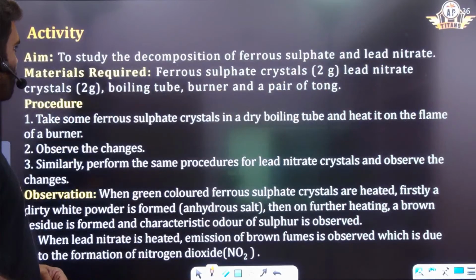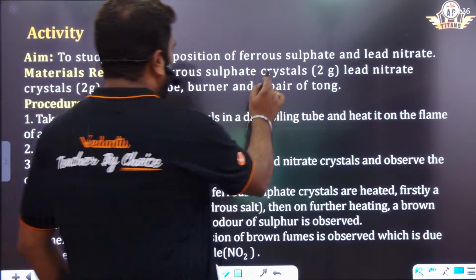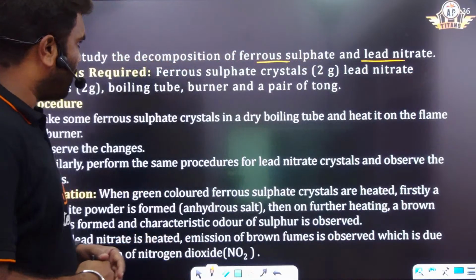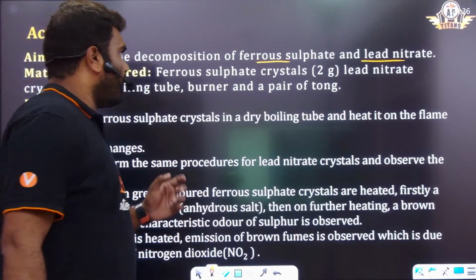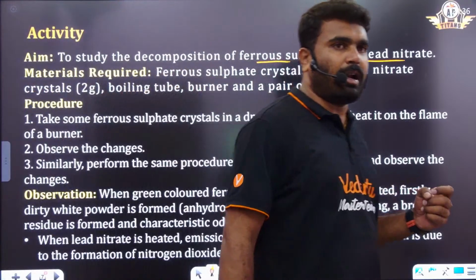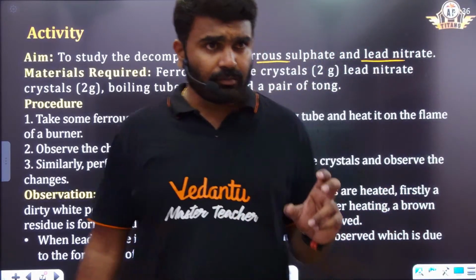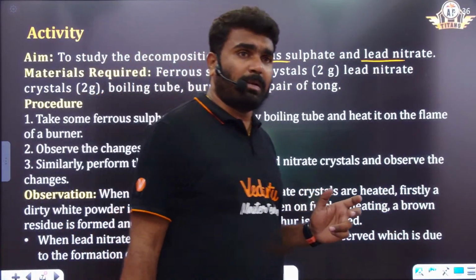Next, to study the decomposition of ferrous sulfate and lead nitrate. So we are going to look at the decomposition of ferrous sulfate and lead nitrate. We already know decomposition reactions.